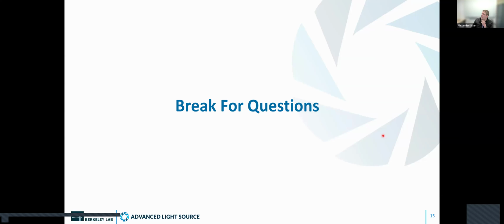Yes, but I think they saturate at similar flux levels, because for the diode or the CCD, it's spread over multiple pixels. But yes, I think it's mainly the readout time, just the time. Yeah, it's much faster. Thanks. All right, Adam, you have a question?